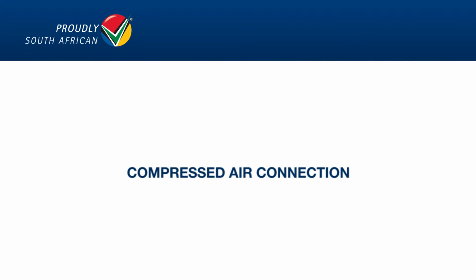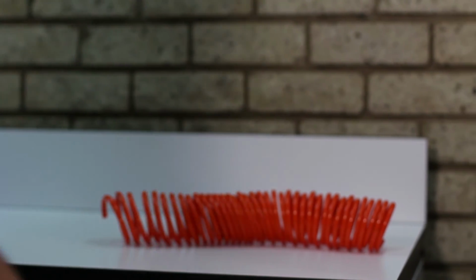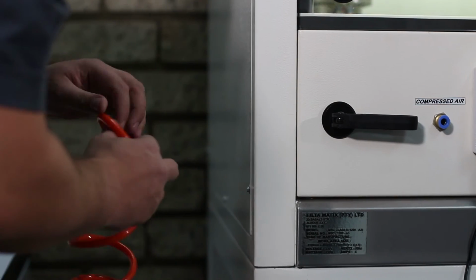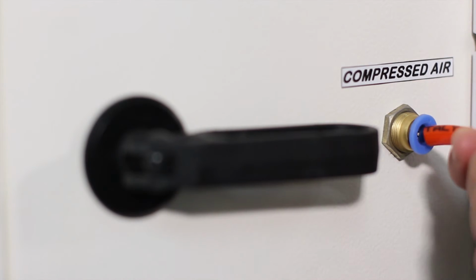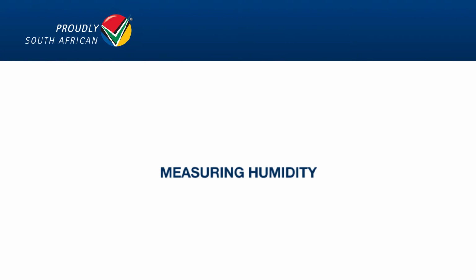Compressed air connection. Dry fog requires compressed air to operate. A minimum compressed airflow of 70 litres per minute at 5 bar is considered optimum. The specifications required for the compressed air will include clean dry air with an outlet to a sterilizing hydrophobic membrane. The compressed air supply will be located outside the cabinet, and a flexible hose will deliver the compressed air to the inside of the cabinet via a supply tap in the hood or via a connection in the cover plate. A manual valve on the compressed air supply pipe will enable the dry fog to be turned on or off from outside the cabinet.